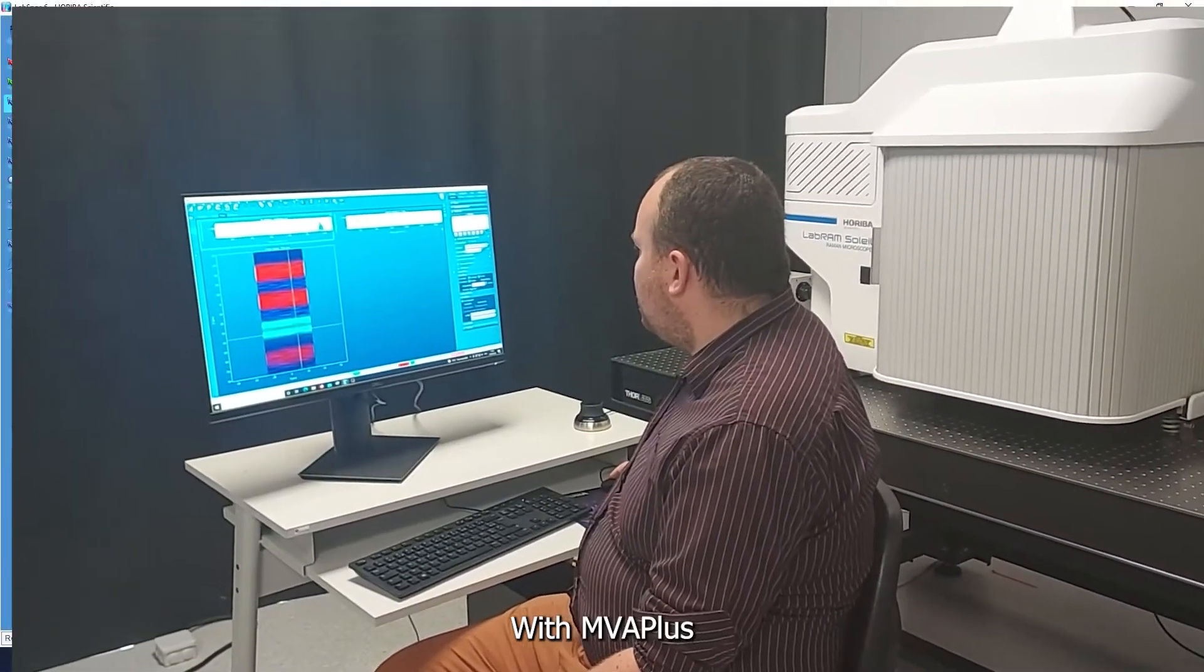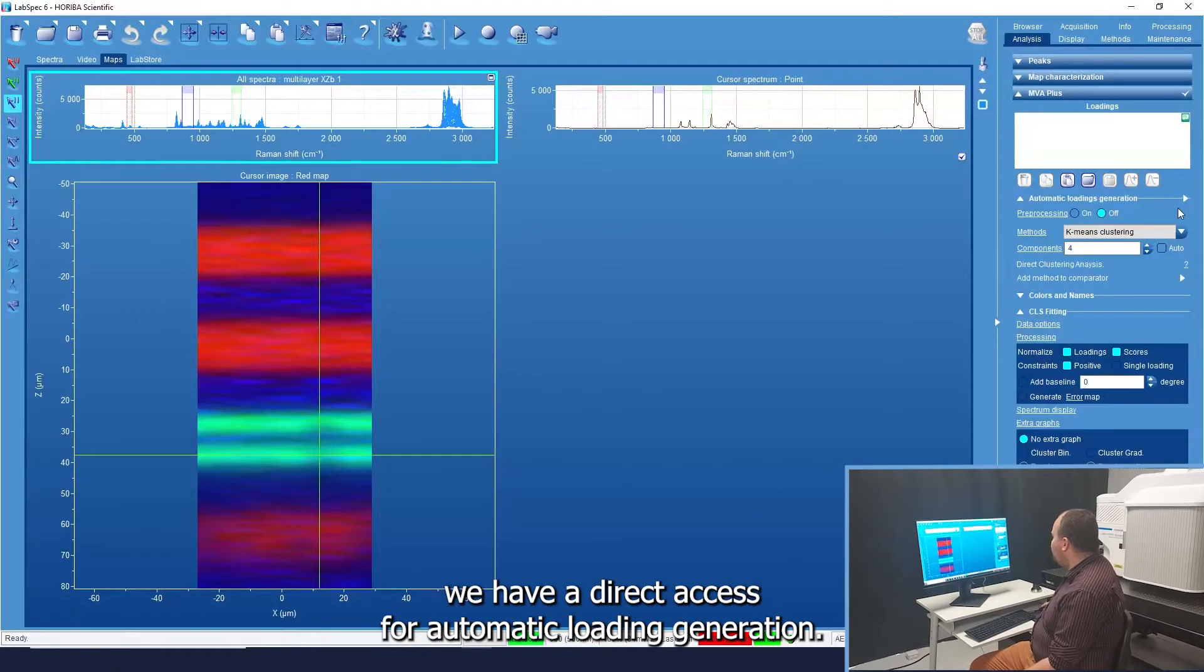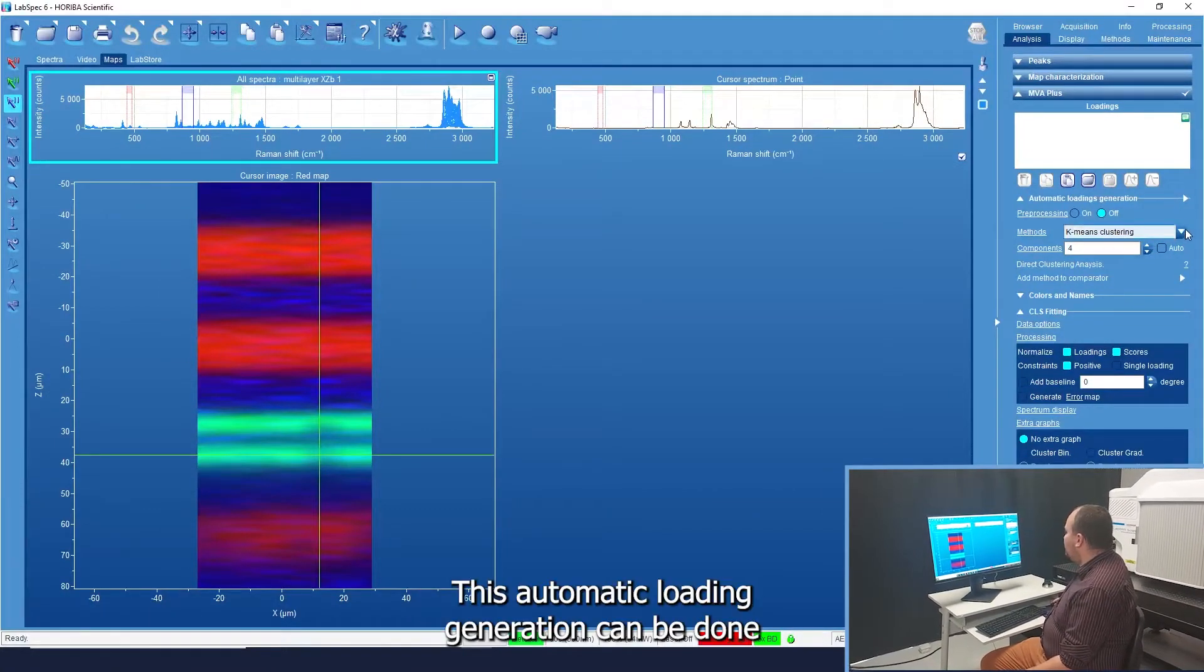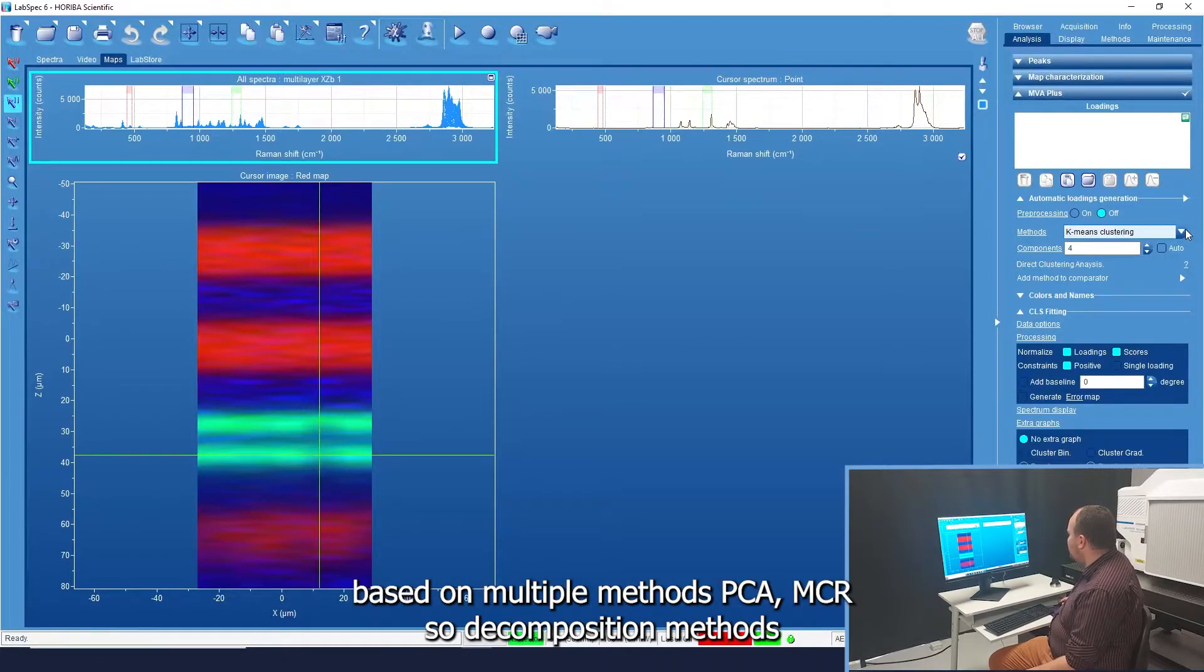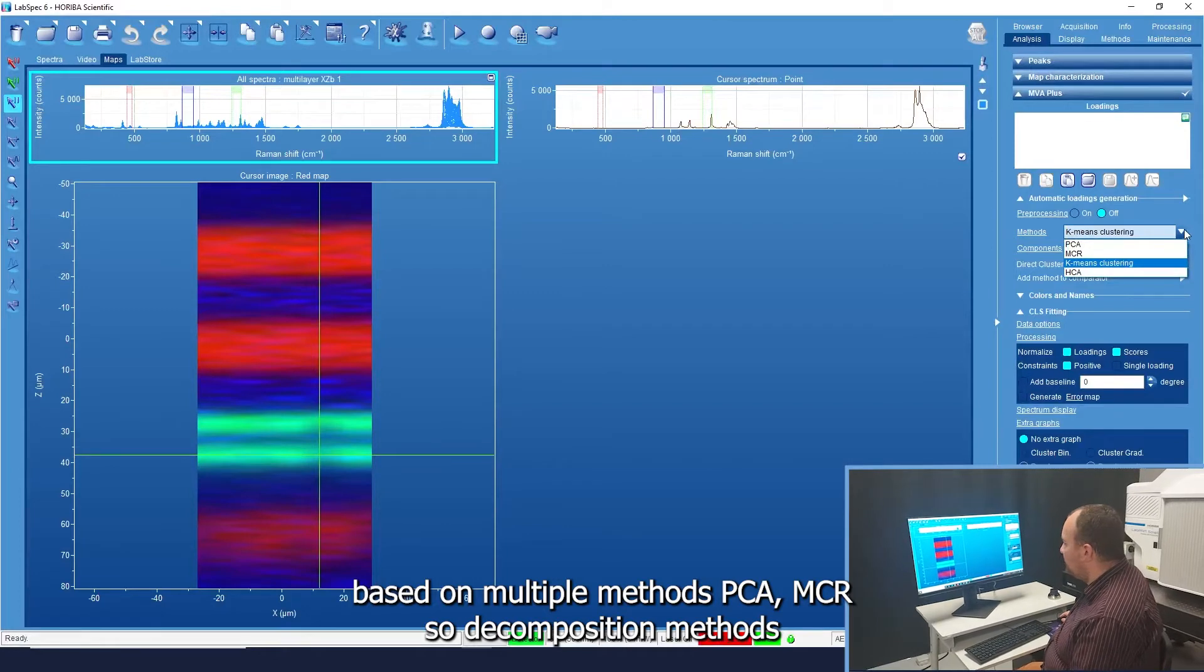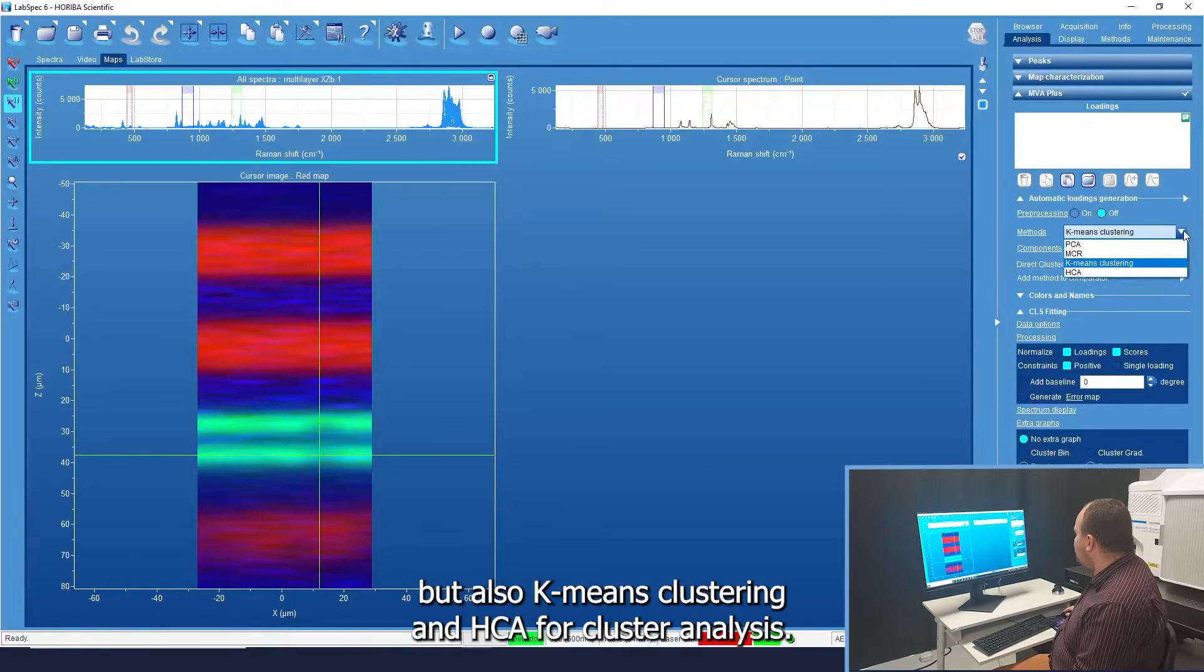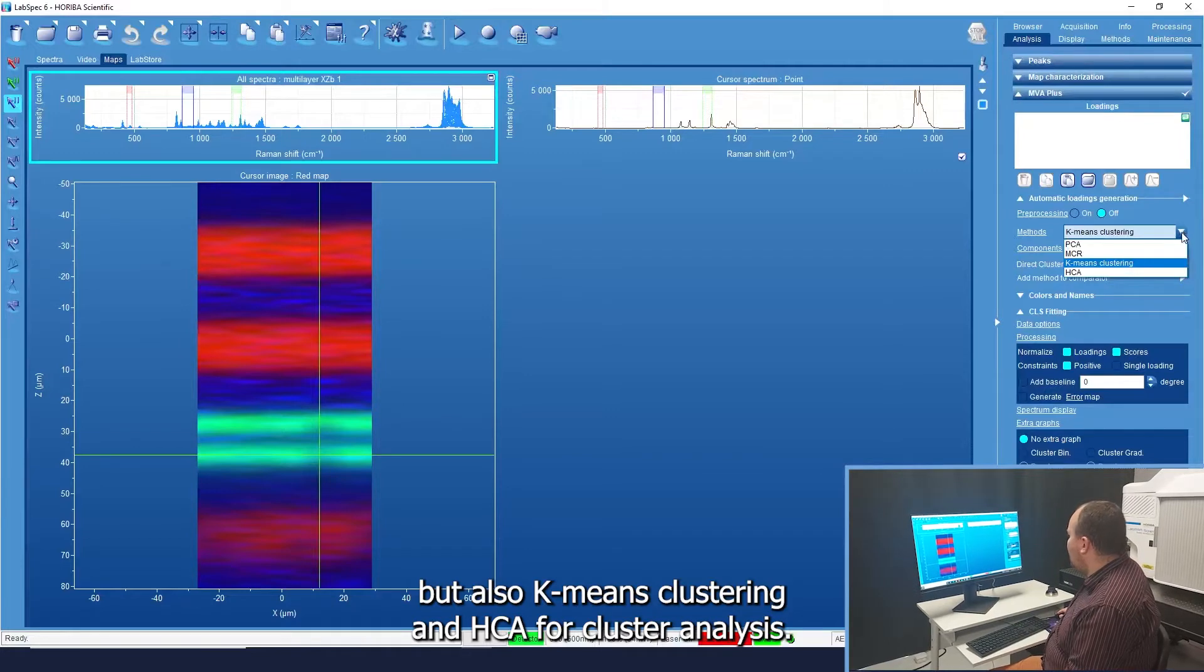With MVA Plus, we have direct access for automatic loading generation. This automatic loading generation can be done based on multiple methods: PCA, MCR, the decomposition methods, but also K-Means clustering and HCA for cluster analysis.